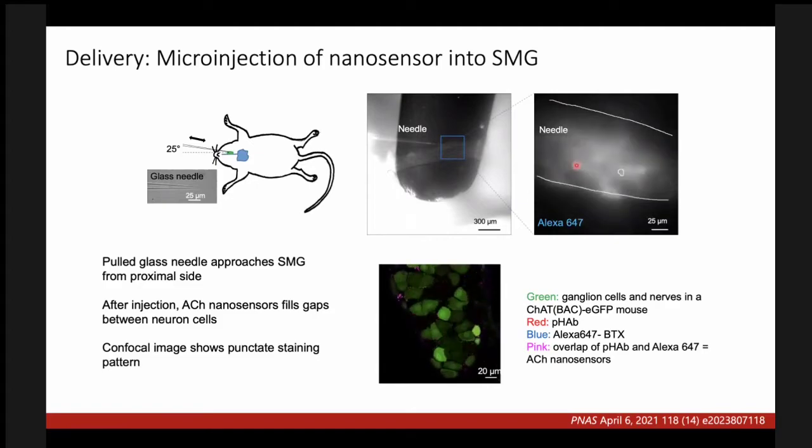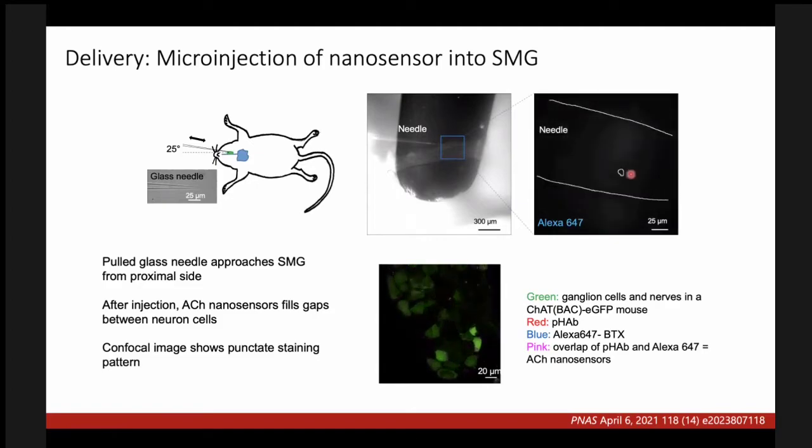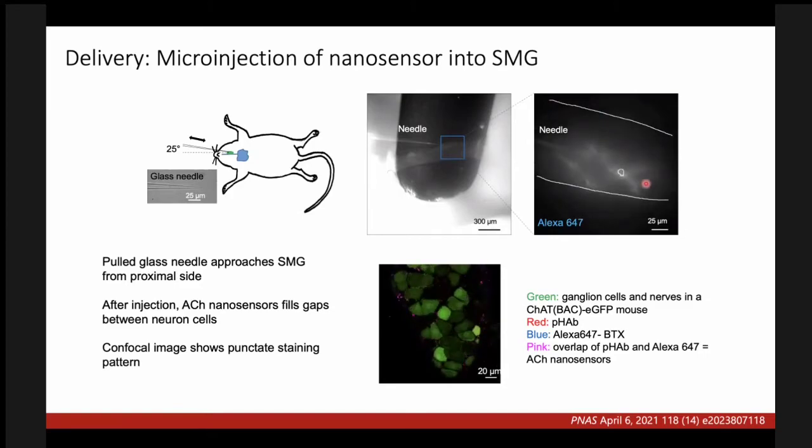A lot of sensor labeled that tissue, and you can actually see the cell borders, and it labels very, very quickly. That targeting ligand binds to the receptors very, very quickly, and the excess sensor diffuses away. So we don't have a high background of sensor that doesn't belong where it's supposed to go. It diffuses away, and we're left with a nicely labeled ganglia here in this area of interest, and it's pulled tight so that we can do some good imaging here.